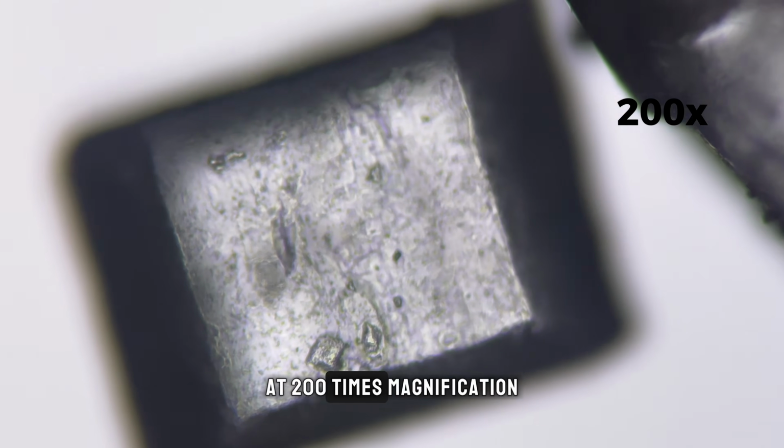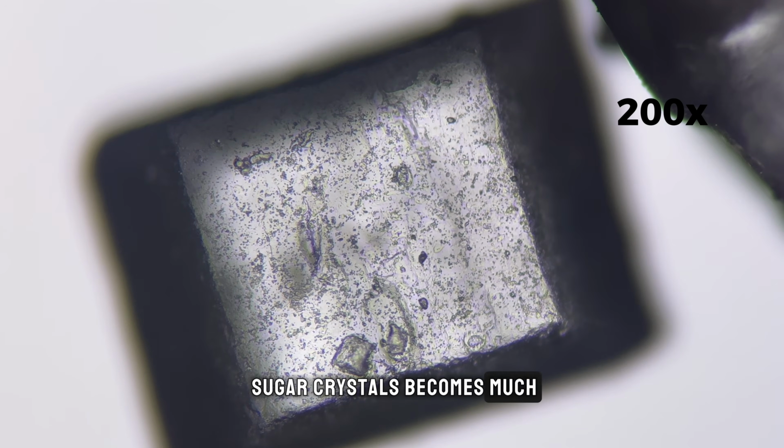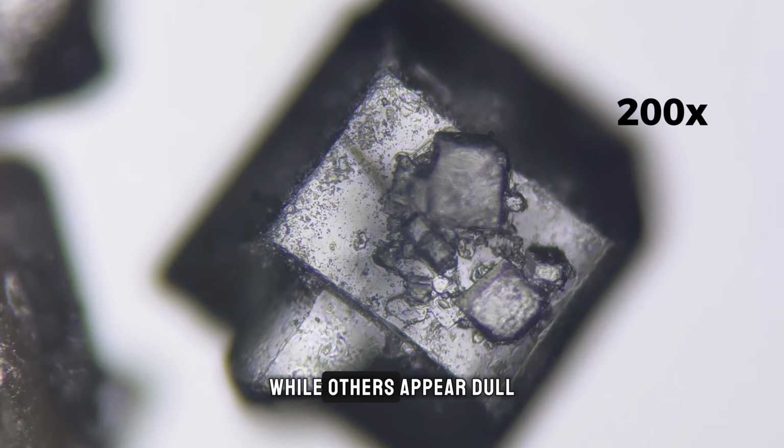At 200 times magnification, the internal complexity of sugar crystals becomes much more noticeable. The flat surfaces that looked smooth before now reveal fine textures and microscopic imperfections. Tiny pits, scratches, and irregular marks scatter across the crystal faces. Some areas reflect light strongly, while others appear dull and cloudy.